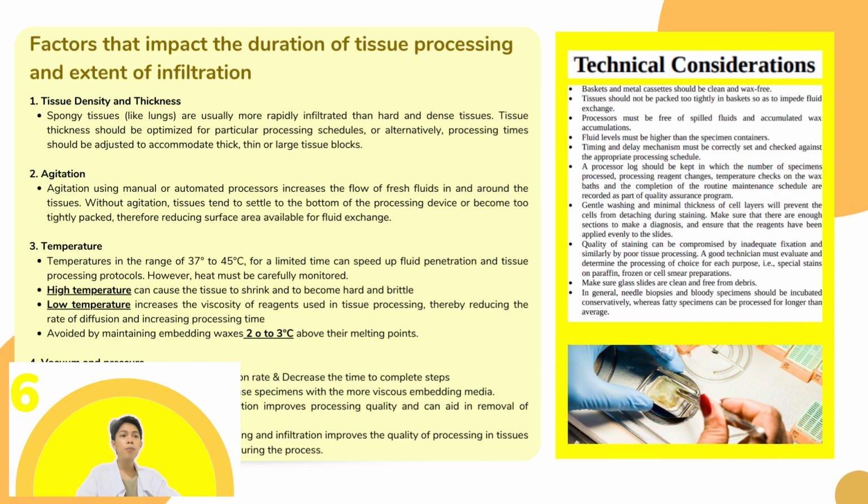In general, needle biopsies and bloody specimens should be incubated conservatively, whereas fatty specimens can be processed for longer than average. So remember, bloody specimens should be incubated conservatively. Fatty specimens can be processed for longer than average.